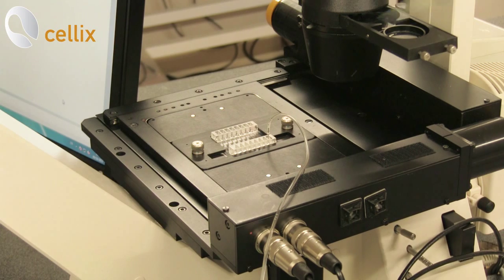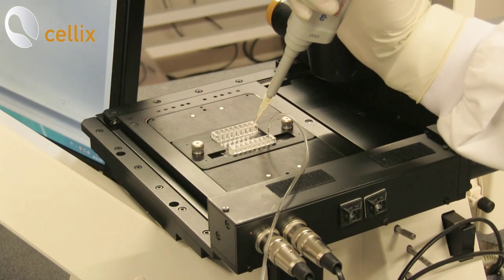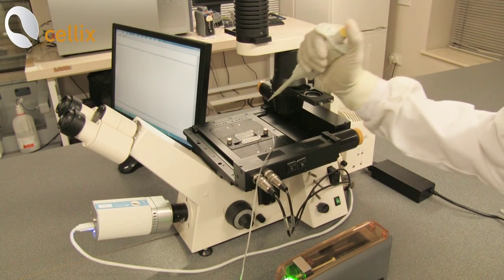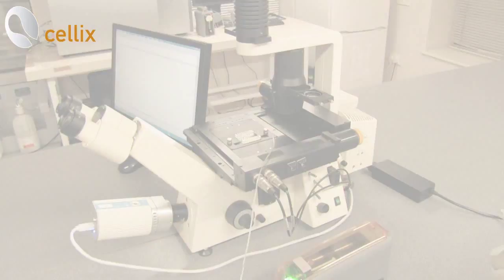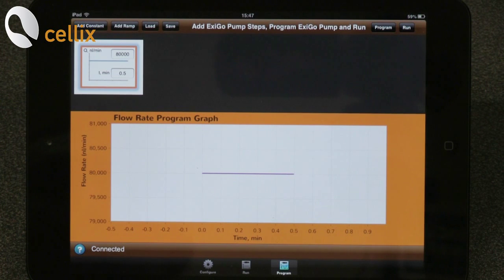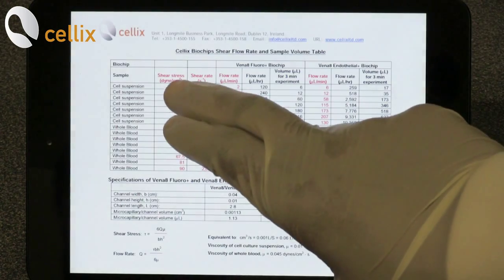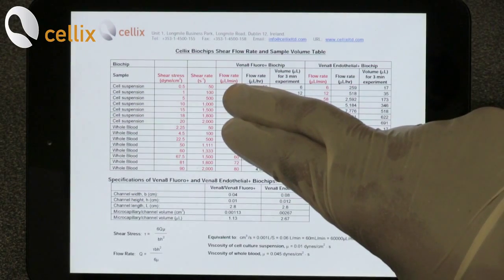Once the channel is washed, remove the waste from the other side of the channel using a pipette. Take the sample and load it on the other side of the channel. We would like to run the assay at 0.5 dynes per centimeter square. Using the provided table, we find that to achieve 0.5 dynes per centimeter square, the flow rate should be set to 2 microliters per minute.